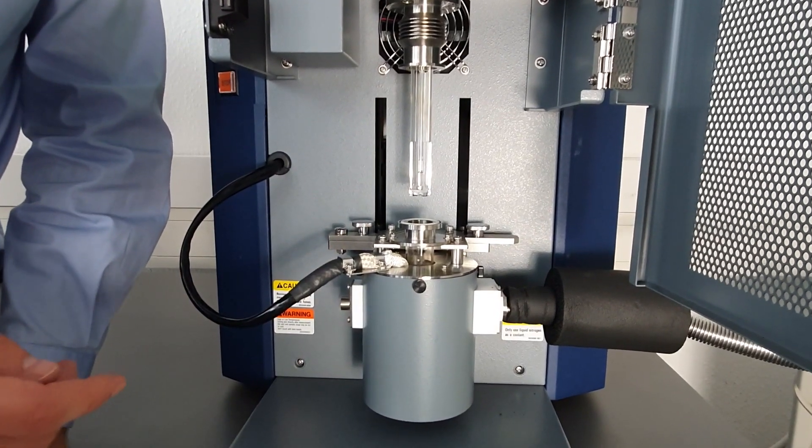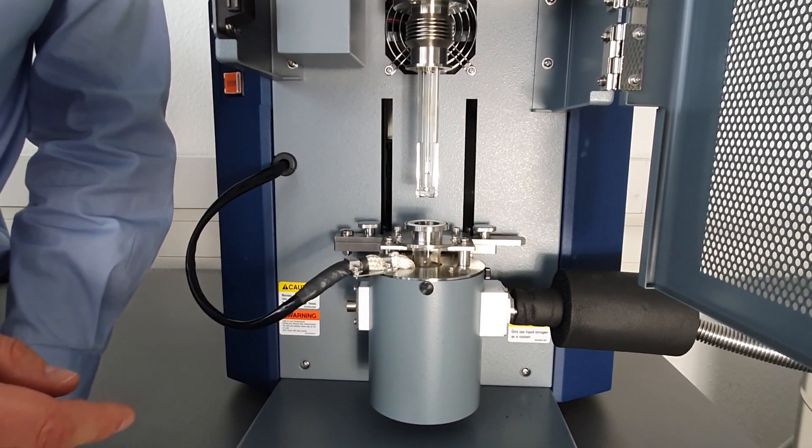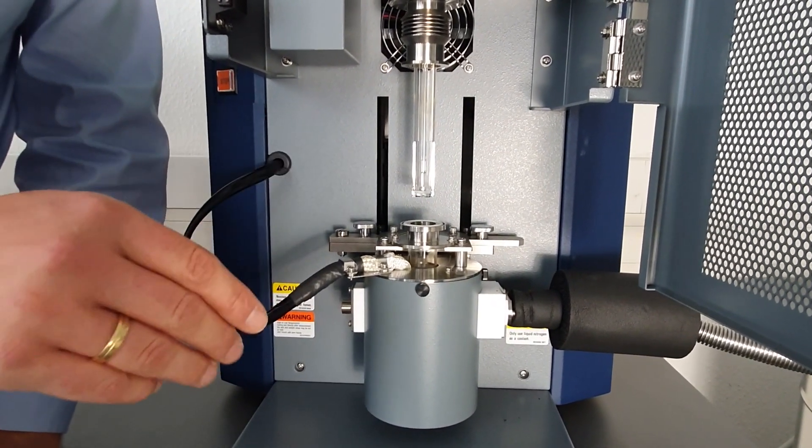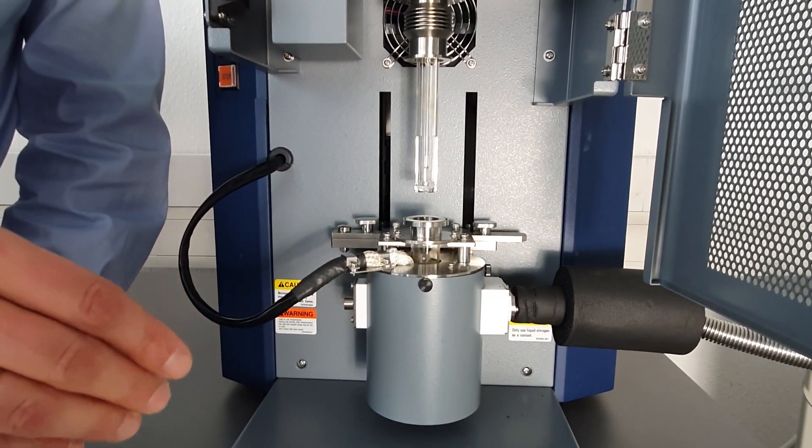Of course, Hitachi offers a wide variety of different sample holders and measurement probes according to your application.